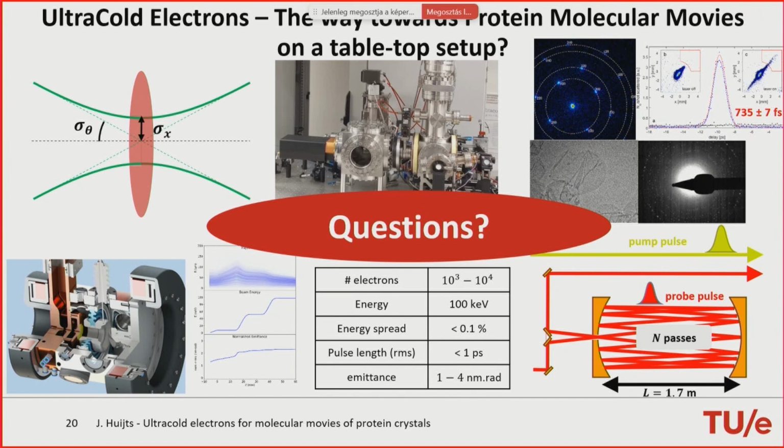Naive question, sorry. So why microED, that Petra mentioned? Why wasn't it such a problem to get the coherence length compatible with unit cells and microcrystals? And you do have this challenge?